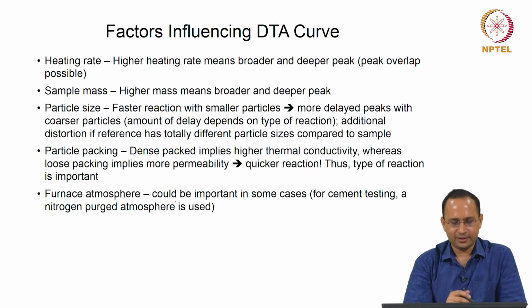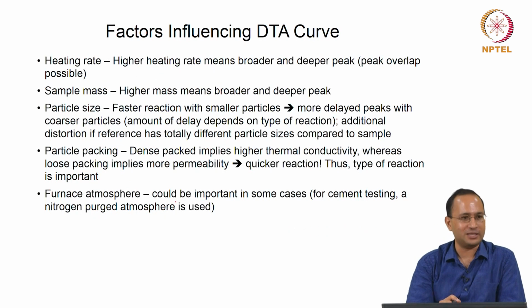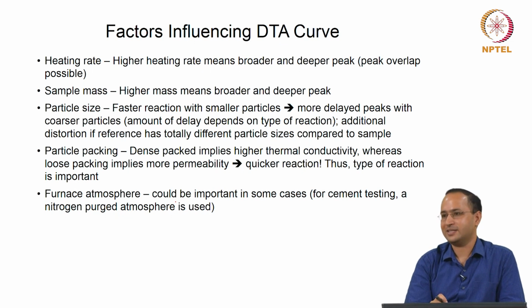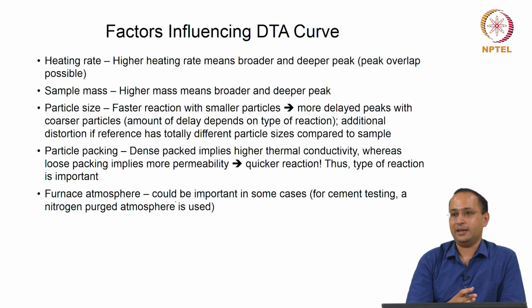So same thing, now we will go over heating rate, for an example. We said heating rate, right, you are heating the material, the sample. Now I can use 5 degrees Celsius per minute versus 10 degrees Celsius per minute versus 15 degrees Celsius per minute.